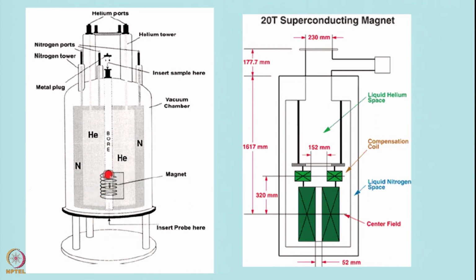If the current is going in a superconducting coil, there is no resistance for it; the superconducting coil has zero resistance. Therefore, the current does not decay at all. Current does not decay means it keeps going. Once you induce current in a coil like this, it will keep going without any decay. Therefore, it can last for a long time.